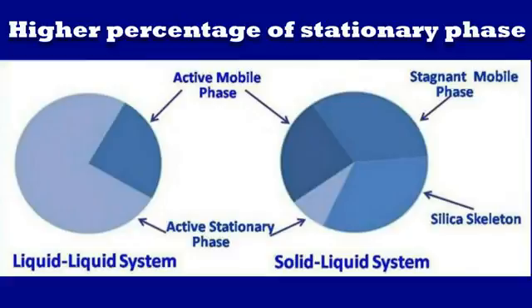In a liquid-liquid column, you have 75% stationary phase and the remainder is mobile phase. Because of this opposite relationship between stationary and mobile phase, high mass loadings of sample are achieved and the solvent usage required to purify them is very low, typically only a fifth and often as little as a tenth.